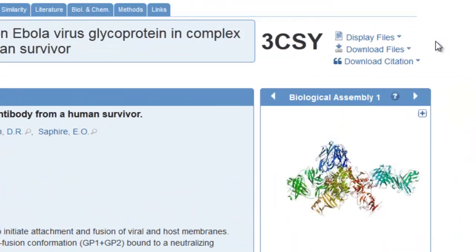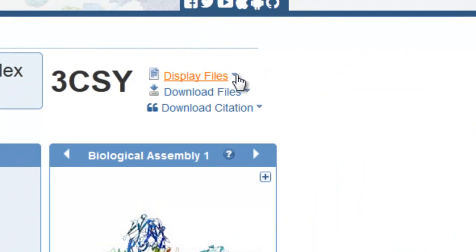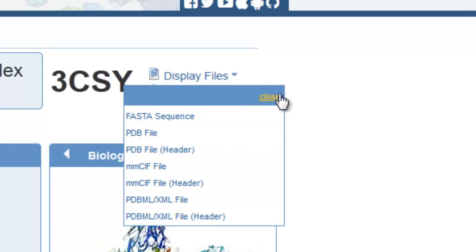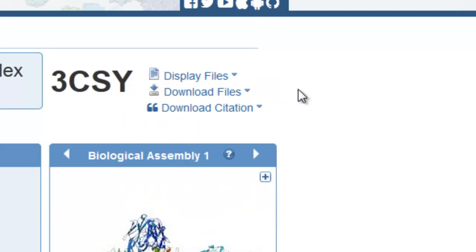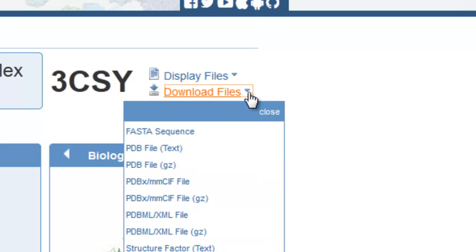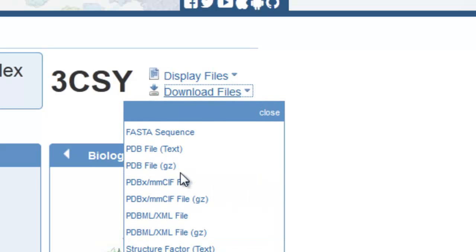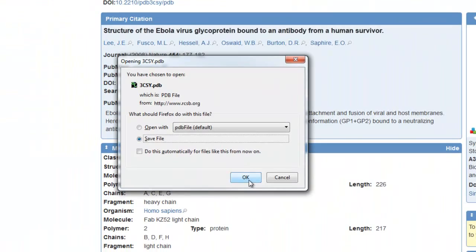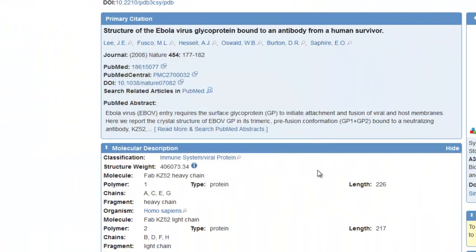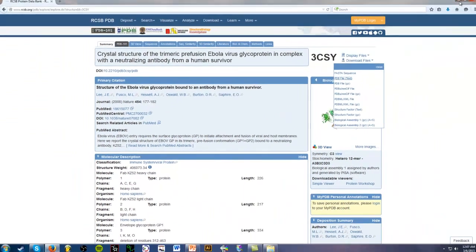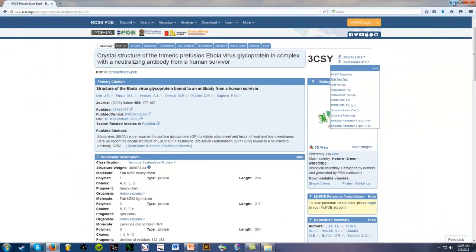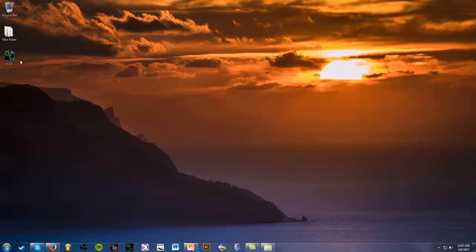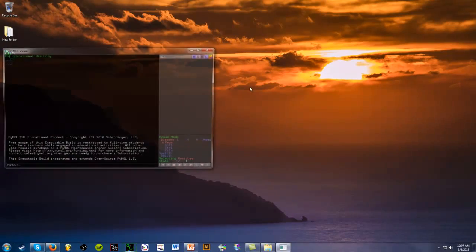We're going to go ahead and download the files. So we're going to click Download Files, pull down menu, and we're going to download the text file here, PDB file text. We're going to click on that, save it, and then we're going to open it in PyMOL.